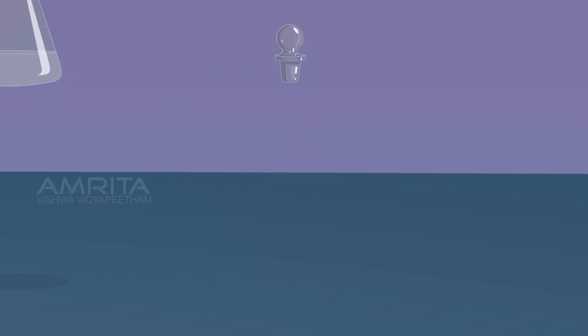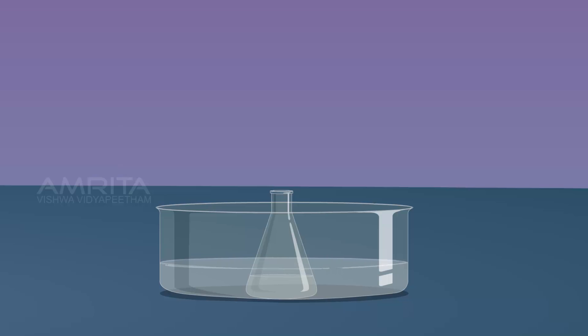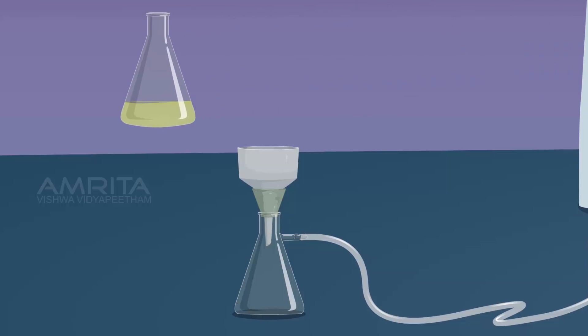Then cool the contents of the flask by placing it in a dish containing ice water for a few minutes. On cooling, yellow coloured precipitate of Dibenzal Acetone separates out. Filter the precipitate using Büchner funnel.